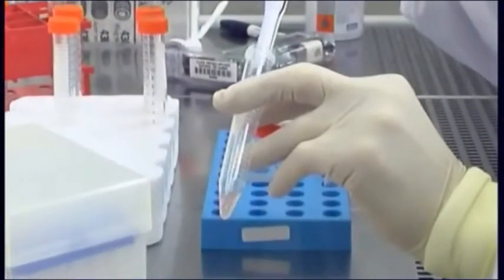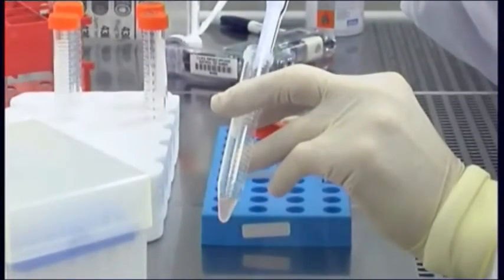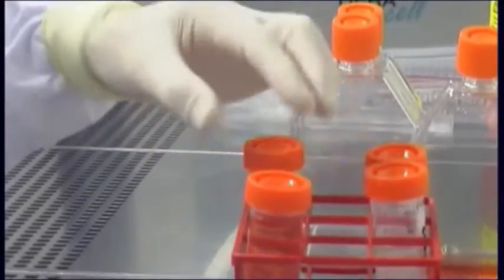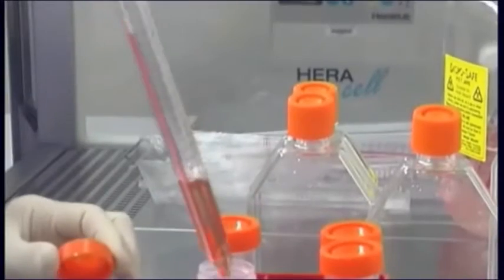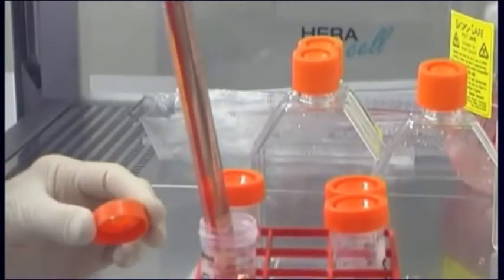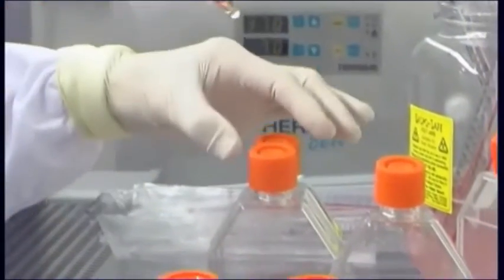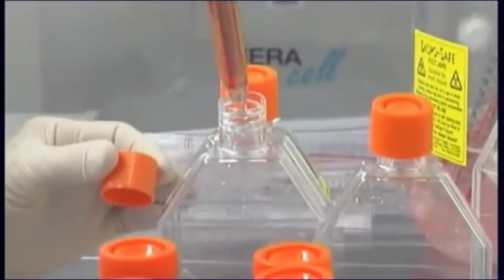Remove 100 to 200 microliters of cell suspension and perform a cell count. Add fresh medium to dilute the cells to an appropriate volume. Aliquot the cell suspension into fresh flasks at the desired seeding density.